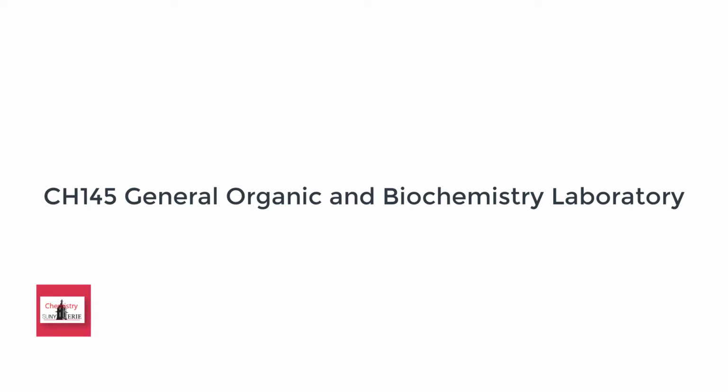Welcome to CH145, General Organic and Biochemistry Laboratory. This demonstration is on laboratory measurements and units. Part A, Measuring Length.